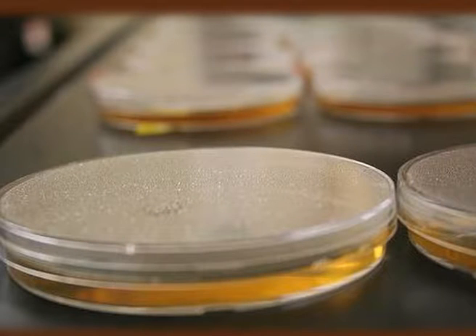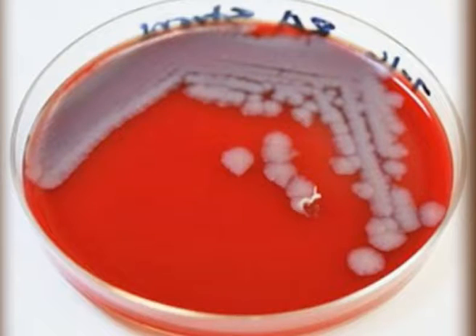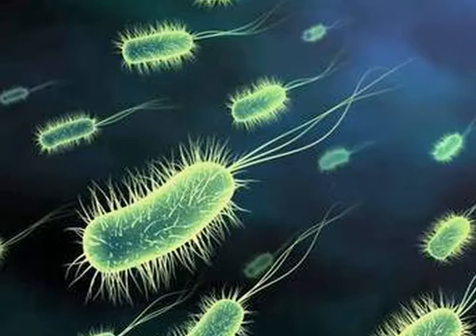Welcome, viewers. Today, in this session, we are going to talk about culture medium. Culture medium plays a very important role in any kind of microbiological studies. Culture medium is generally used for the growth of bacteria under artificial conditions in the laboratory. Culture medium generally consists of different kinds of elements.